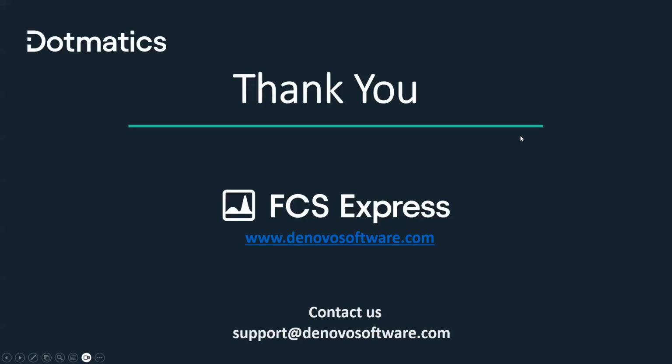I want to thank you. I hope this was really helpful. I hope that this was able to really show you the power of FCS Express, and how you can transition from FlowJo onto our software easily, without any problems, and some of the tricks and trades.